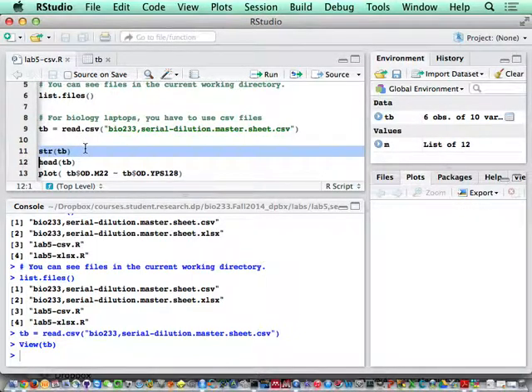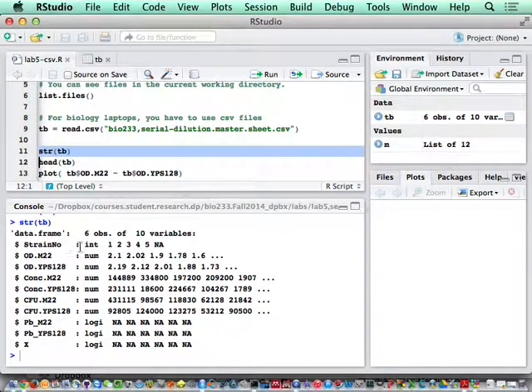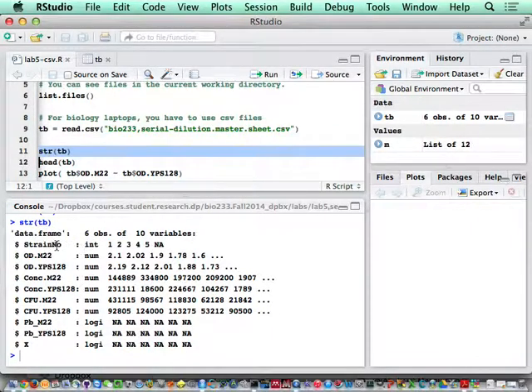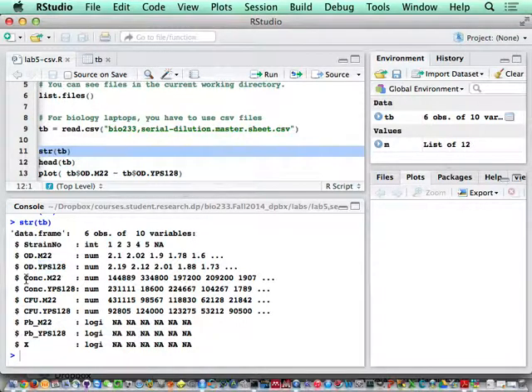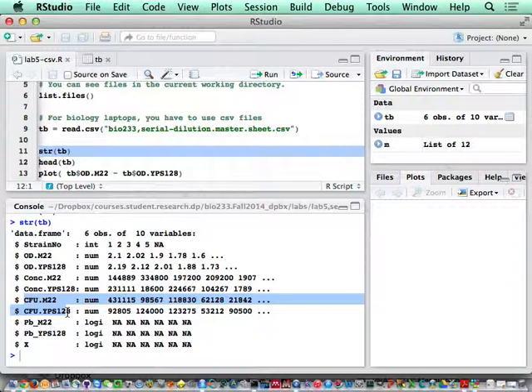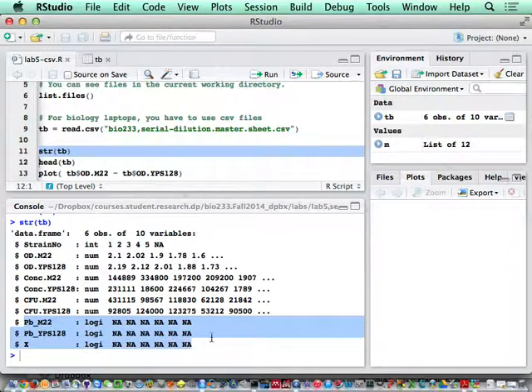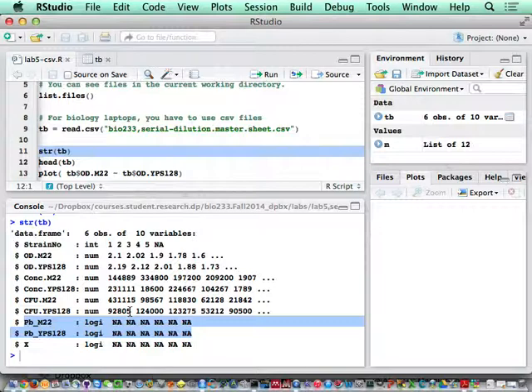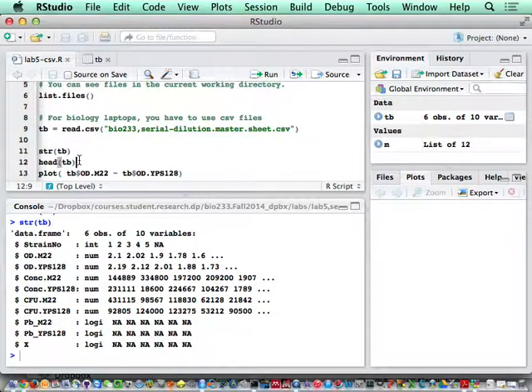Structure. You have to look at the data. This one has some strain number, optical density for M22, optical density for YPS-120A, cell density and concentration from hemocytometer count, and CFU from the colony forming unit plate counting result, and a percentage of black which right now is empty. Everything there is called NA for not available. That's a special number in R. If there's missing data, that's called not available.